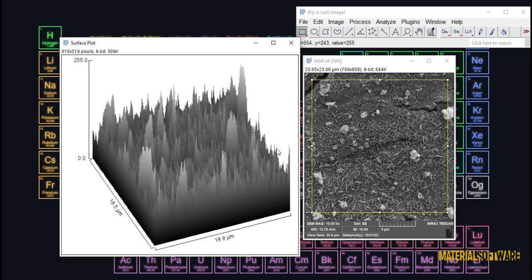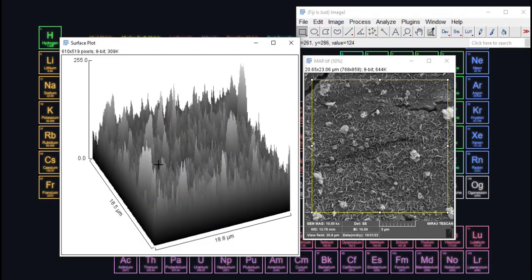A window will open where we will not make any changes in the settings. Click OK. A new window will open that shows you some numbers that are not exact. As I said, you can check different areas in a relative manner.